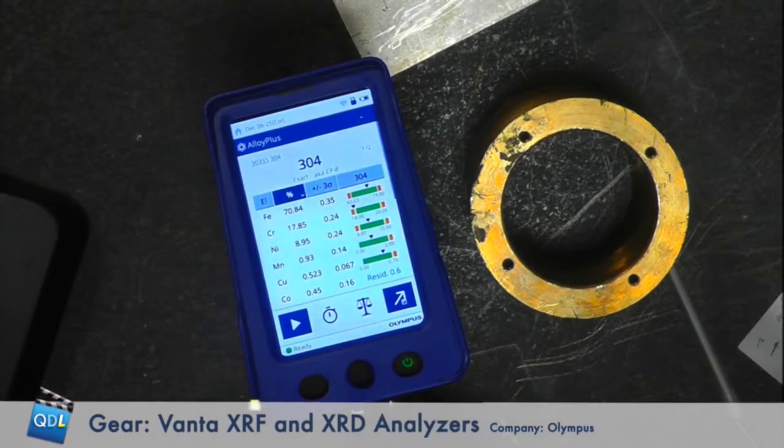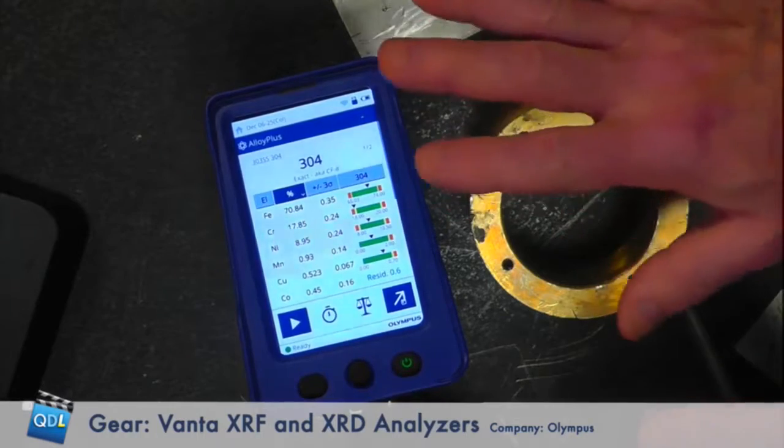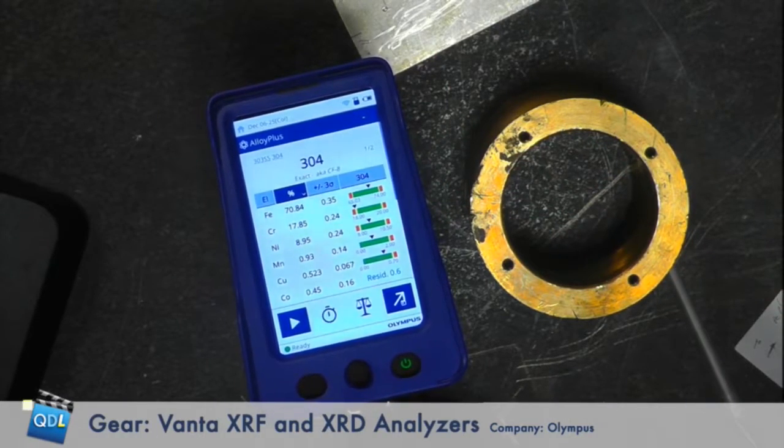You can see the chromium reading is right on the edge. If you're taking multiple samples from a shipment and consistently seeing readings on the edge — in this case for chromium — that might indicate you want to do further testing or contact the manufacturer. Your quality manager in a manufacturing situation, or your reliability manager in a plant, will have protocols for that. You're using the analyzer to verify the chemistry against a mill test report, or MTR, to make sure your supplier sent you what you asked for and what they said they sent. Out in a plant, you verify the right component before you install it — it's a great quality assurance and quality control tool.